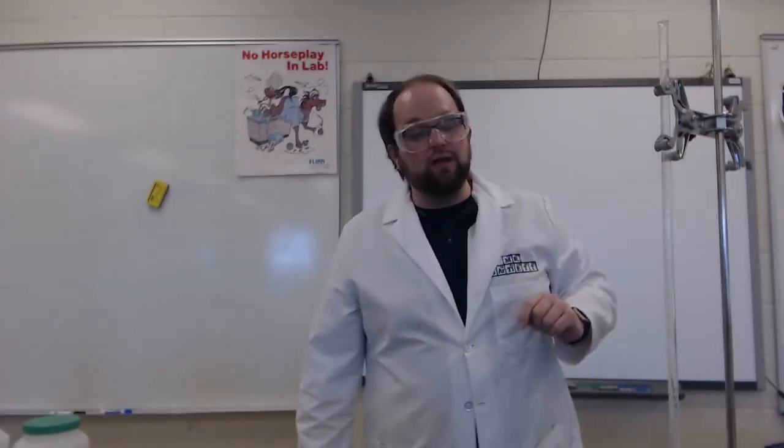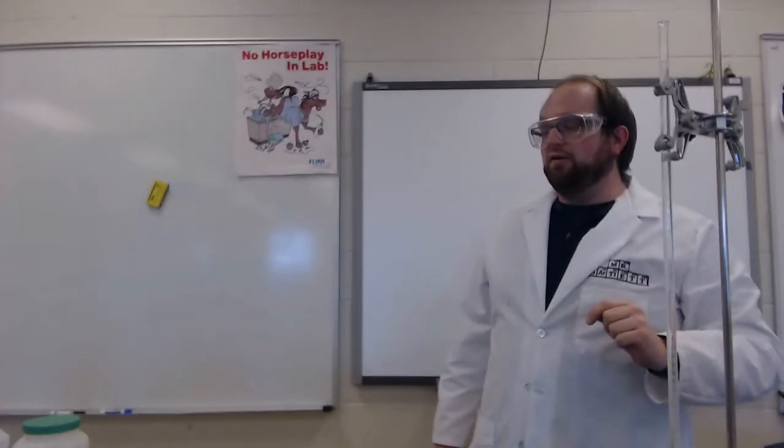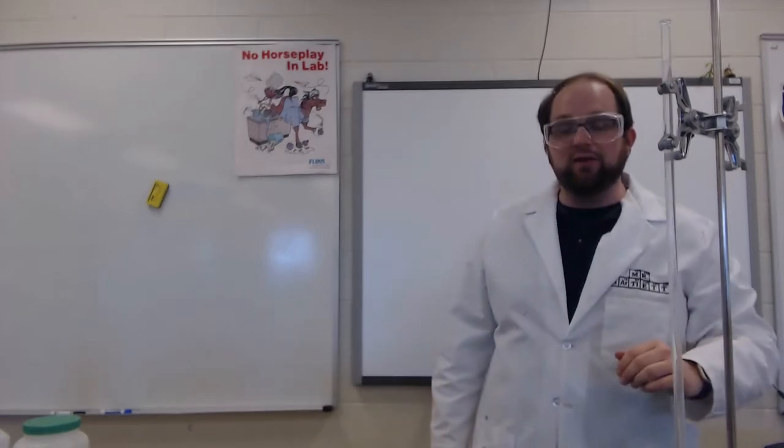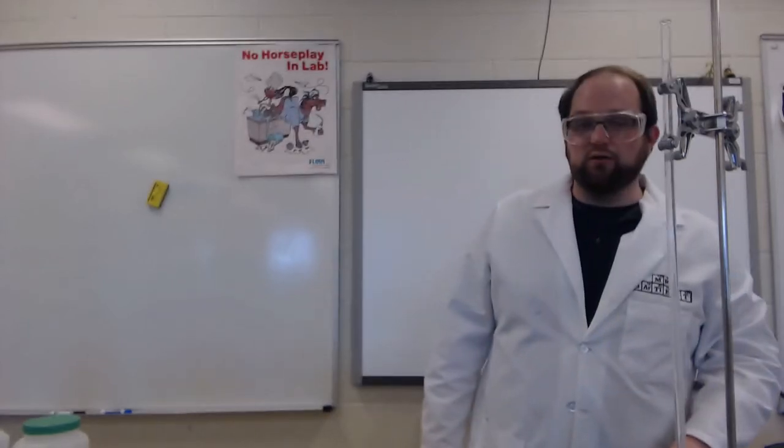We can notice that my burette is nicely filled all the way up to zero milliliters, so my initial for my first trial is going to be zero milliliters. Let's see how many milliliters it takes in order to get all the way down and get a nice, perfect titration.